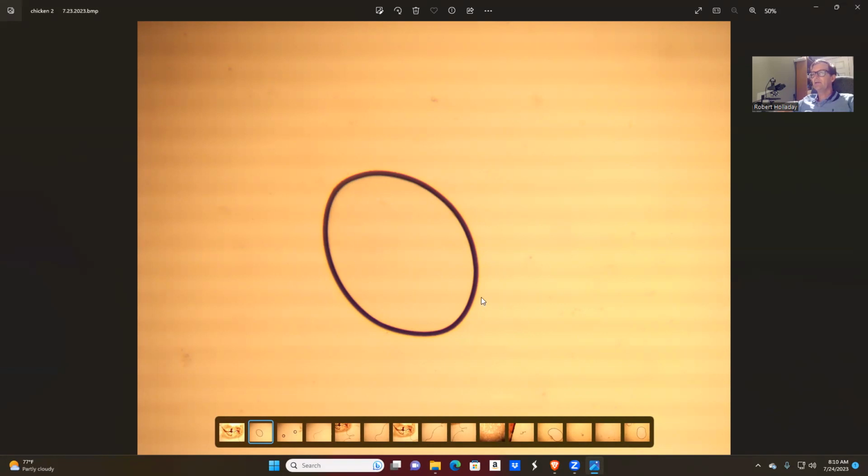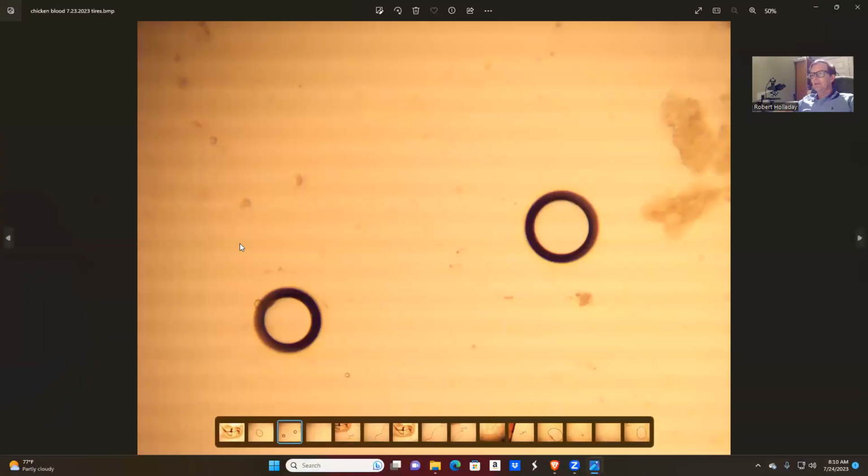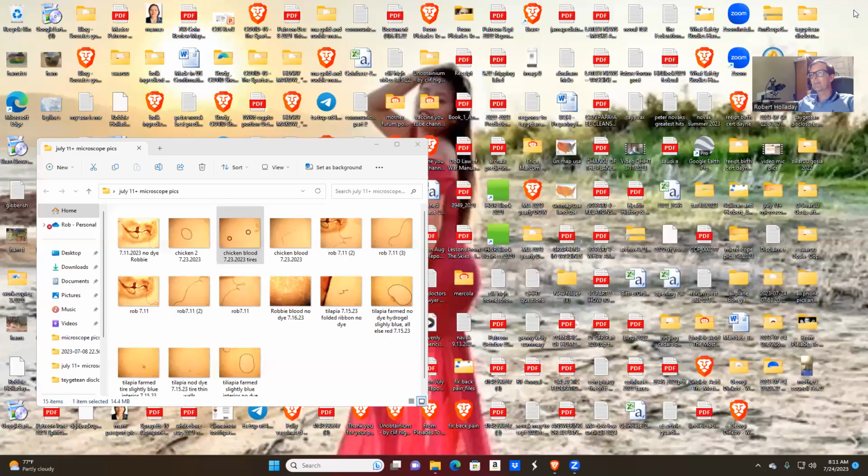But this is just a hydrogel pocket within the chicken. These are tires found in the chicken blood. These here are imperfections in the cover slip. It's always important to put a cover slip on the slide and look at it under the microscope without any blood so you can tell what an imperfection is.